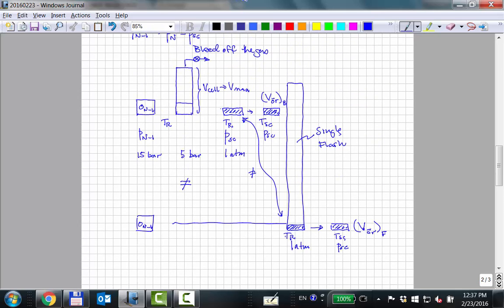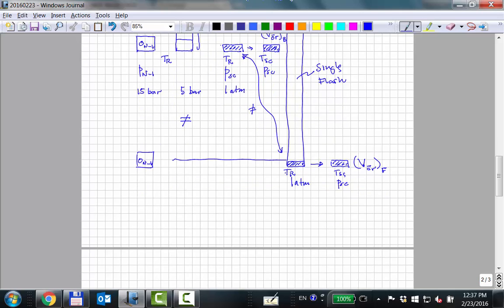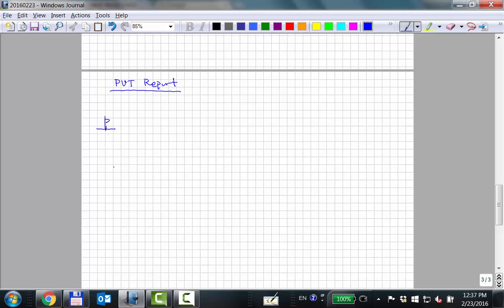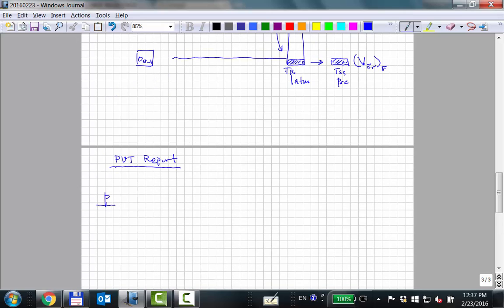All right. Anyway, that's the experiment. So now we've got all these numbers that we've been measuring, and I'm going to explain what's actually reported in the PVT. So in the PVT report, what do we get out? As a function of pressure, let's just summarize what's been measured.